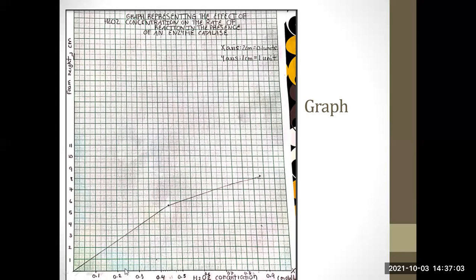And for 5, we could have done the same thing, gone from 5 here, and we would have gotten about 0.38 moles per dm cube, or moles per liter. Now for 7, if we look at the graph, we would have gotten approximately 0.65 moles per liter.